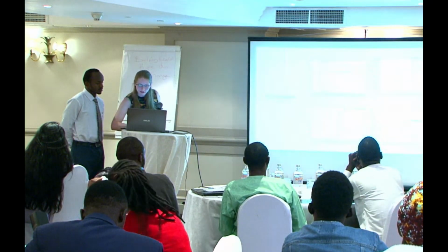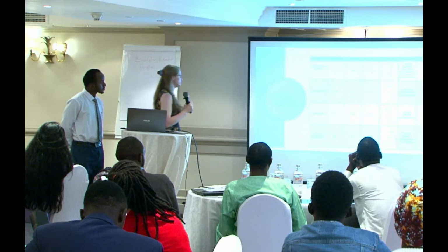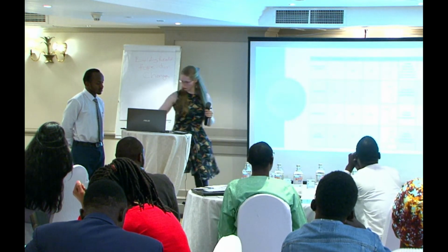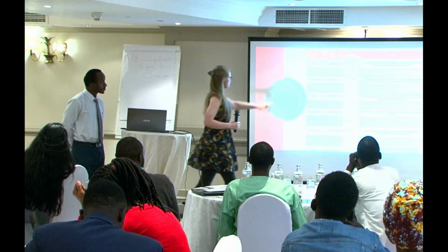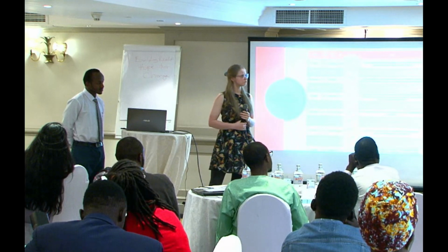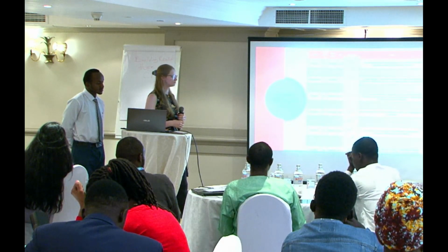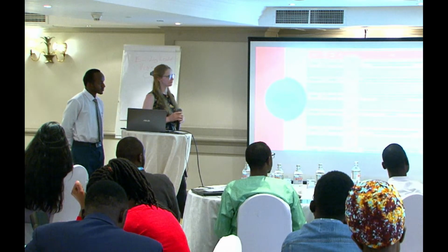Okay. I think that these peak areas... Let's go back. This peak area is already adjusted, I think, for percentage. Go to the other table. And then this right here, this is peak area. So do they make any sense? That's why I'm saying you need to be consistent in your presentation, so that when somebody looks through your data, they quickly identify that yes, it is 4%, it is 10%, this is the most abundant component. But overall, you did well. Try and improve on your slides. Don't tell us that you're going to give us something later on after the presentation.